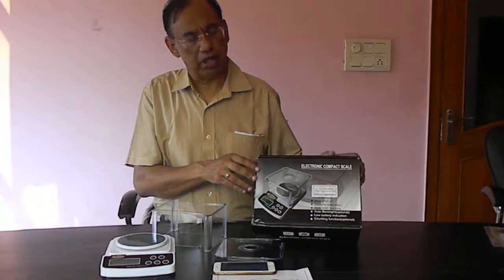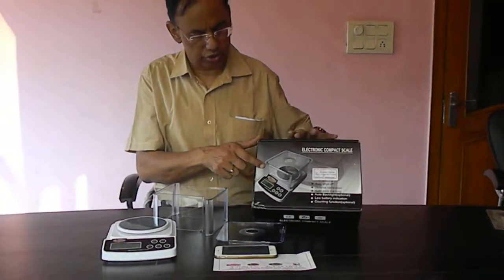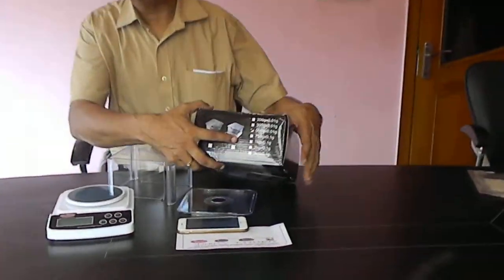This is the digital balance by Abronix Prove. It comes with different plastics.